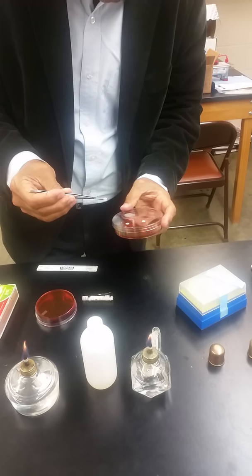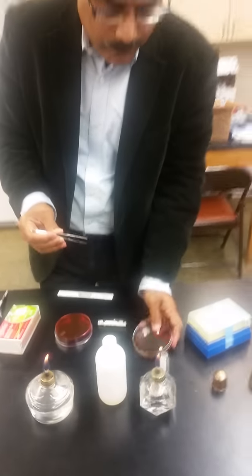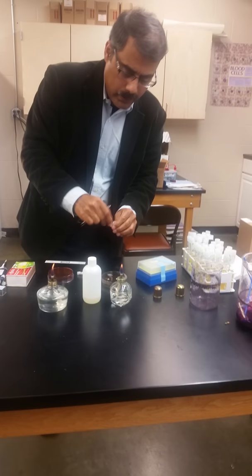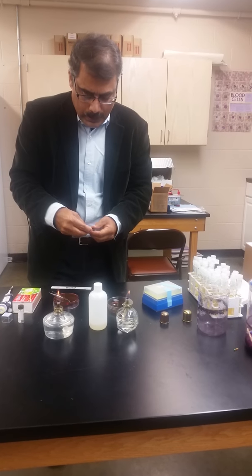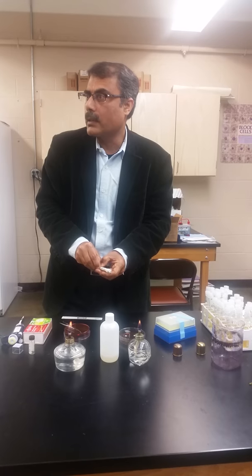Okay, so which is this one here, and that's about it. I have just one more to put, and you can take as many plates, as many bacteria you can test like that.